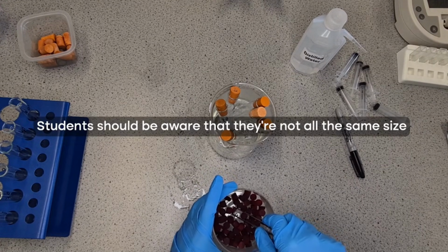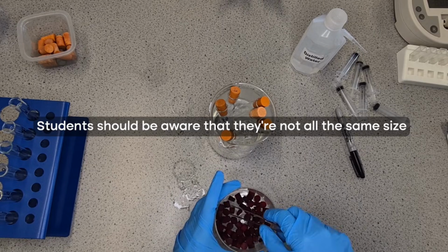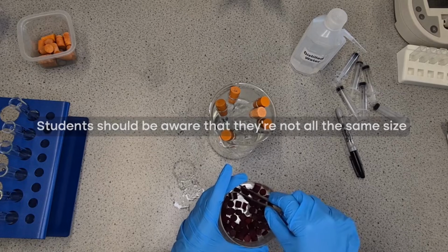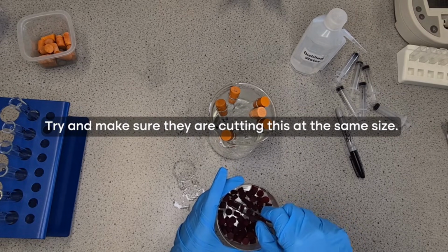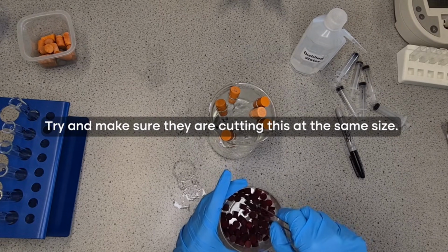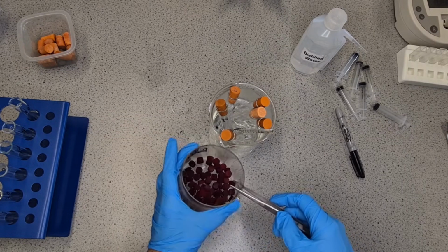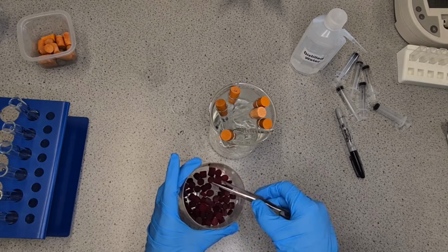So that's one thing students should be aware of, that they aren't necessarily all the same size and they should be. So that's one control variable. So if you do have this, try and make sure they are cutting it to the same size or picking pieces that do all look pretty much the same size. You can also measure the mass to try and help with this, but the surface area is going to impact it as well.